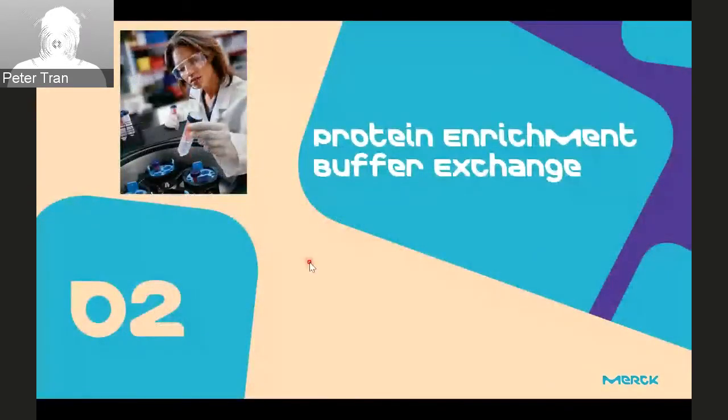Okay, so let's move on to the last section, protein enrichment and buffer exchange. How can we do it? With this, I want to go back to the poll and answer the last poll. What method do you use for buffer exchange? Dialysis, protein precipitation, ultrafiltration. Just pick one that's relevant to you.